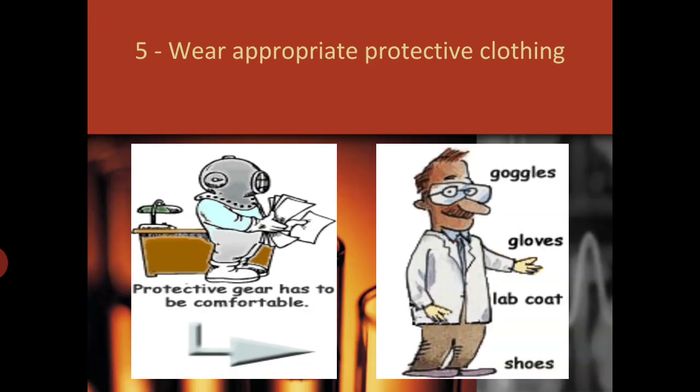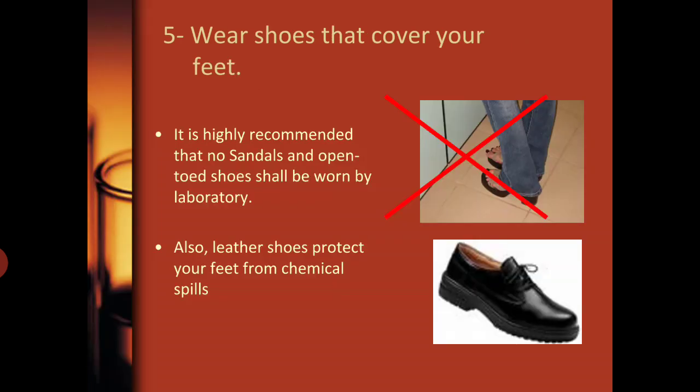Here you can see the basic PPEs, that is your protective goggles, the gloves and the lab coat, and the shoes which completely cover the feet. These PPEs should be comfortable. Coming to the shoes, sandals or open-toed shoes are not supposed to be worn in the lab, and leather shoes will protect your feet from chemical spills, so you are supposed to wear shoes which will cover your feet completely.